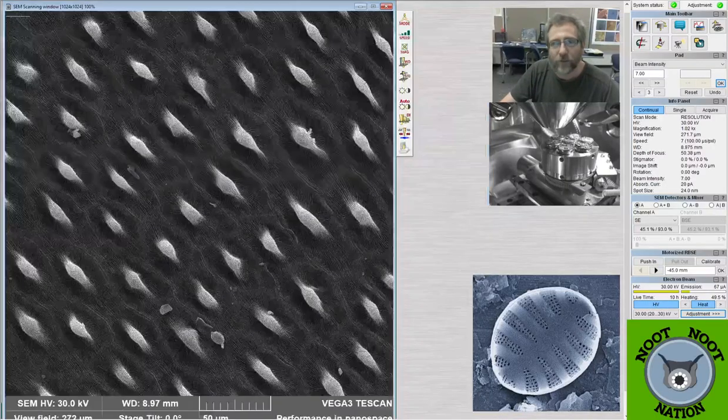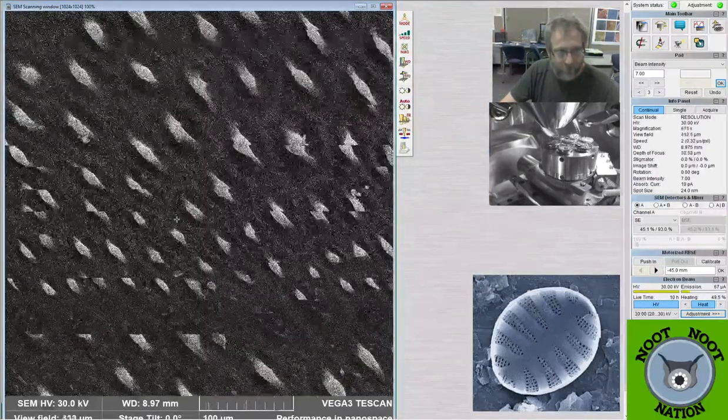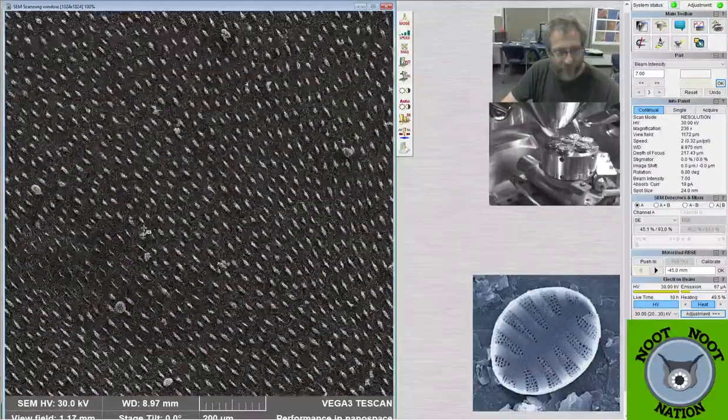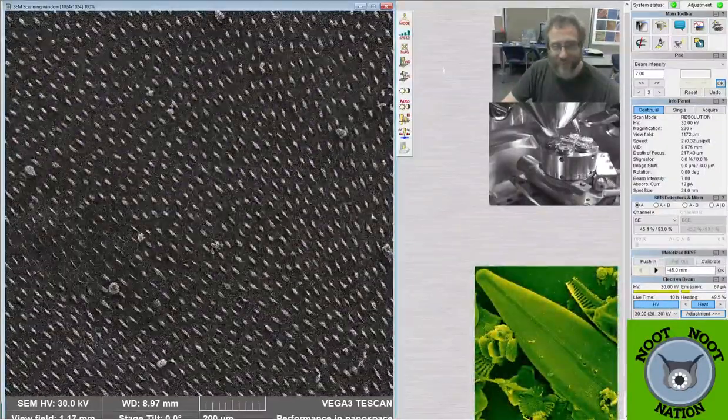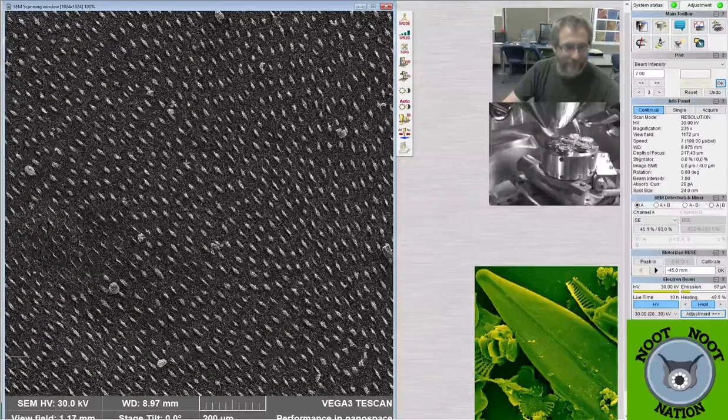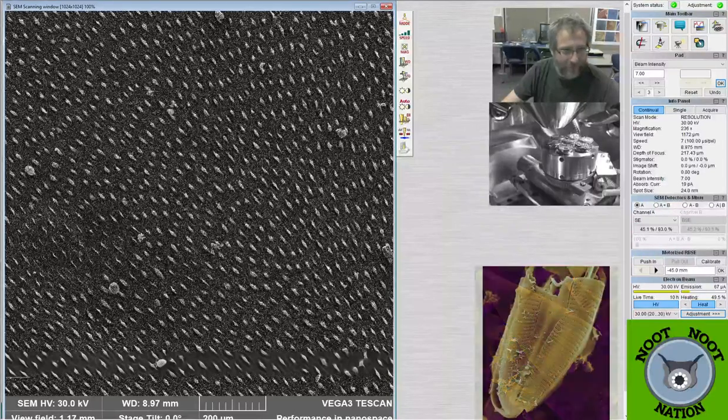And I'm also going to do one where I zoom out a little bit so you can see that. I think this is kind of crazy and also stunning, so I'm going to slow that down because the repeated structures are just amazing to me. And there's a little bit of pollen. This is the Flox pollen right here. I think these are some of the pollen grains, and I'm pretty sure that's the Flox.